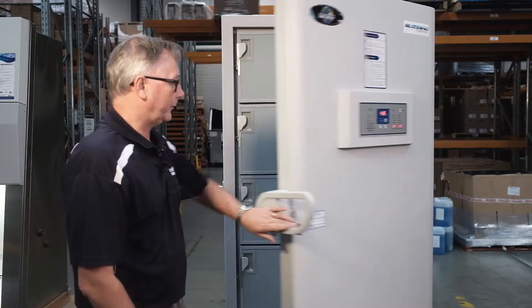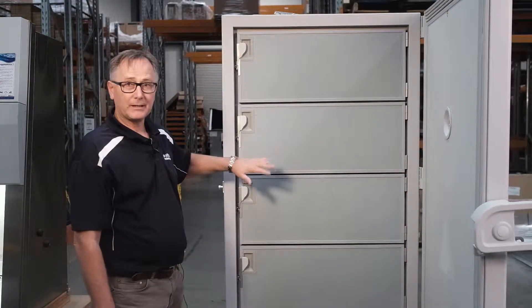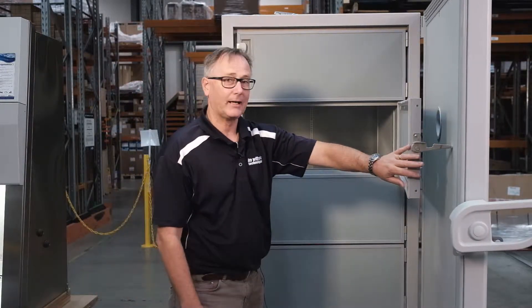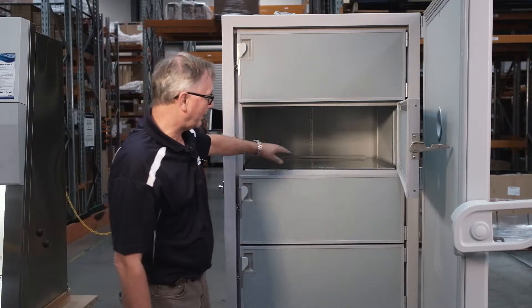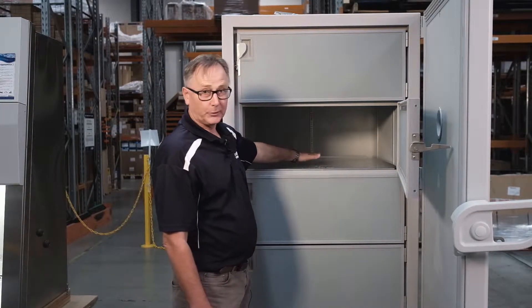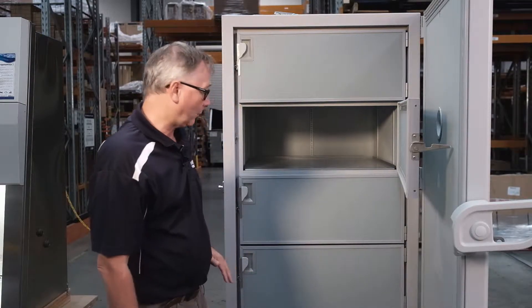We will now look inside the freezer. As you can see, this freezer has four independent compartments, each one isolated and independent and controlled pressure internally for the temperature. It has stainless steel bottom shelving, so it's easy to slide for the racking.